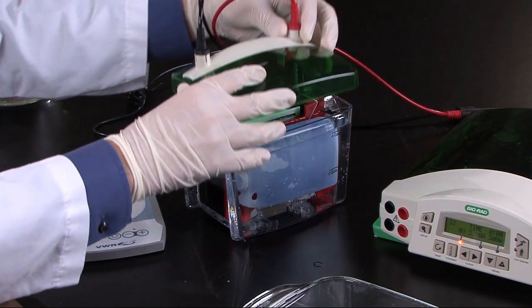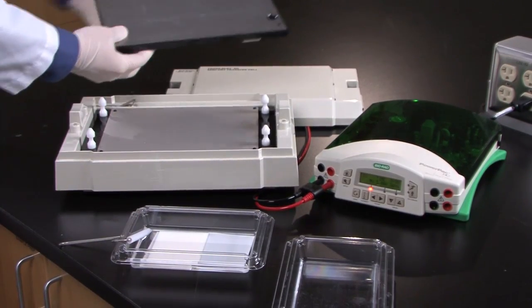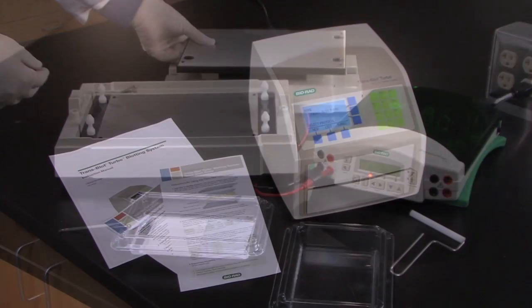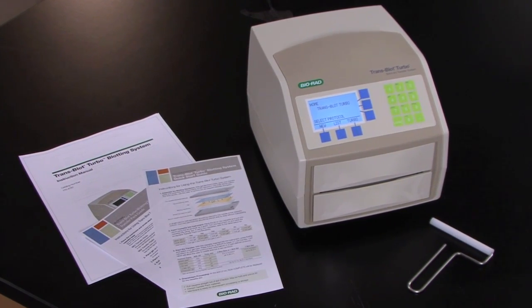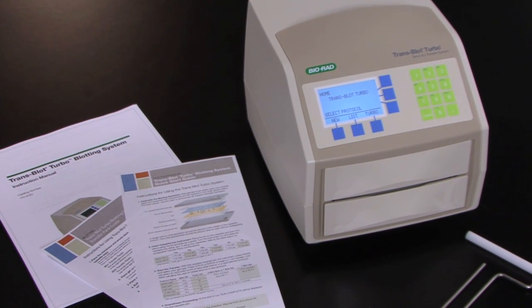Many of you are probably familiar with both tank and semi-dry electrophoretic protein blotting. In this video, we will introduce BioRad's new transfer apparatus, the Trans-Blot Turbo system. We will show you how this new system is faster and more convenient than both traditional techniques.